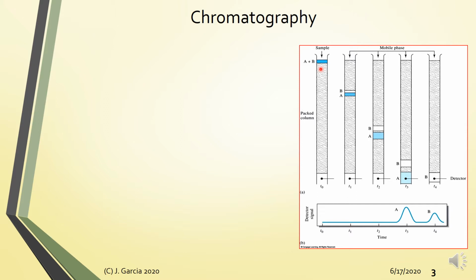And from experience, we know that in column chromatography, if the components of the mixture are colored, we can actually visualize the separation of these components, and we call these structures here your bands, BANDS, no? So these are your bands, like a rubber band, no? So that is what the scientists imagined when they discovered this.